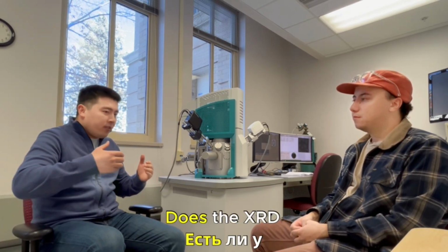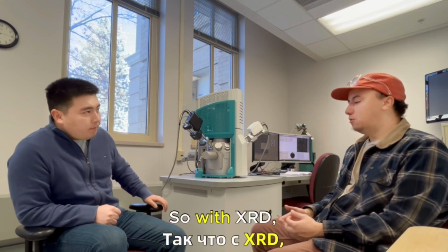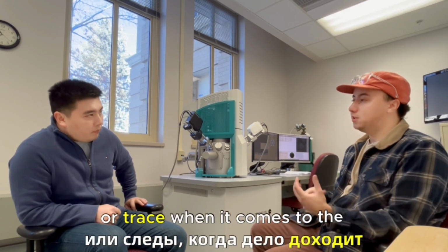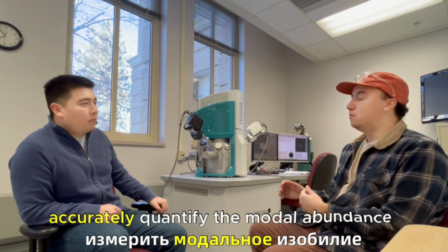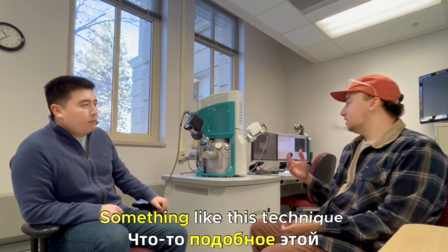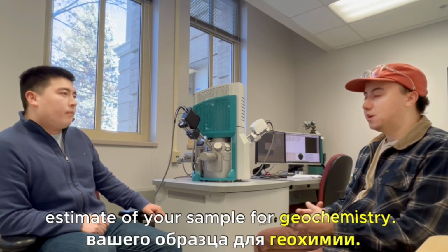Does XRD have any disadvantages? Yeah, sure. In comparison with SEM or XRF, for example? Totally. With XRD, for the most part, a lot of the data that you get is either major, minor, or trace when it comes to the actual abundance of a certain mineral phase. It's very difficult to accurately quantify the modal abundance of your mineralogy. You can do Rietveld refinement, which can get you a lot closer to an actual mineralogical breakdown of your sample, or something like a whole rock estimate of your sample for geochemistry.